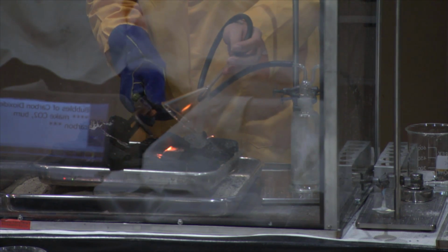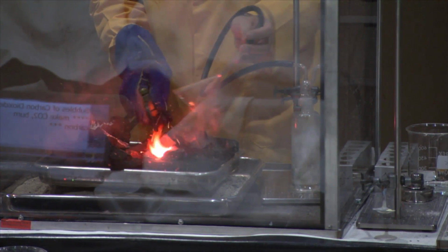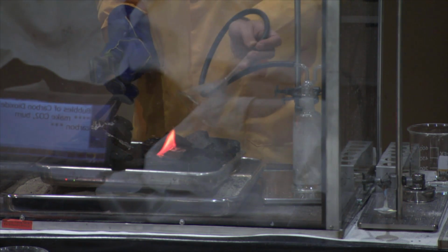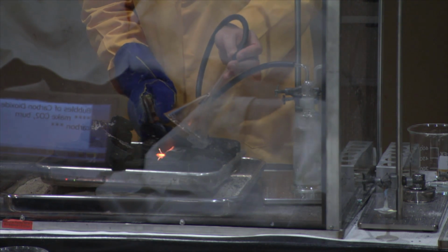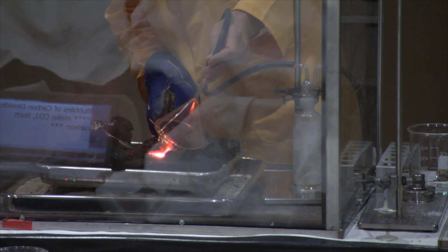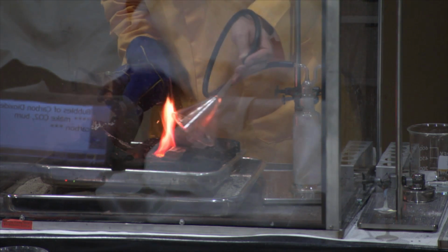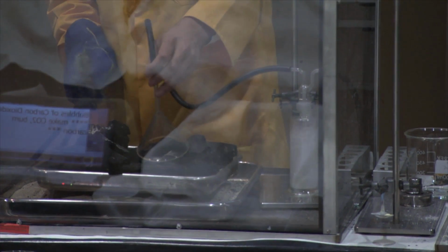Okay, so we're just drawing some of the gases off of this, and some of this is carbon dioxide. And I'm hoping that we should see a change take place in the liquid. I think you can see that it's beginning to change. It's not so clear as it used to be. It's beginning to get cloudier, okay? And this is as the calcium hydroxide that we have in there is reacting with the carbon dioxide.